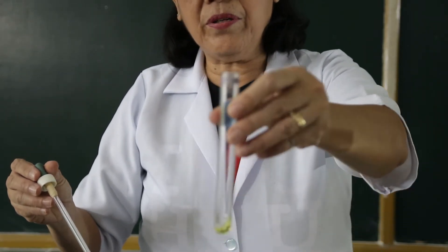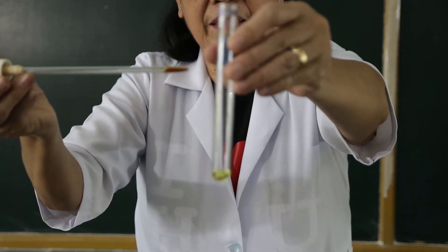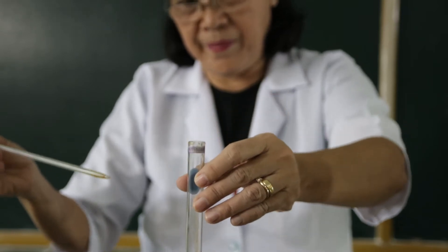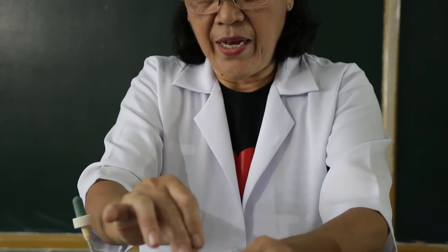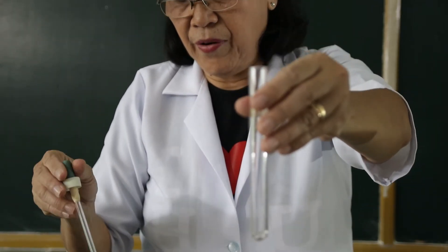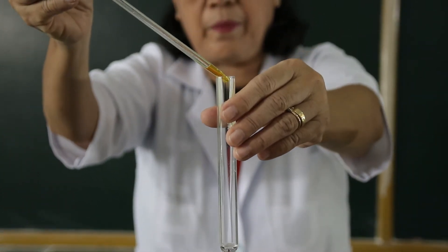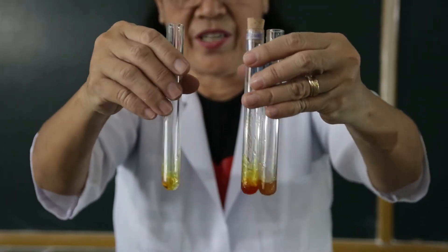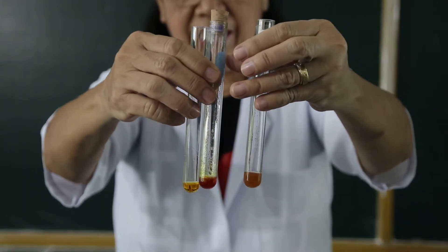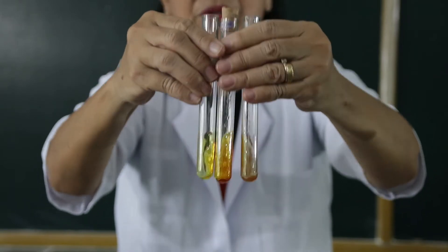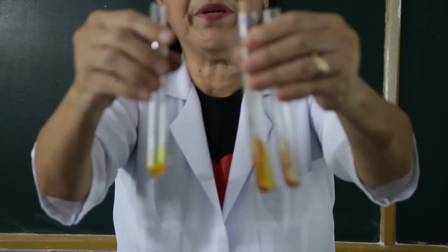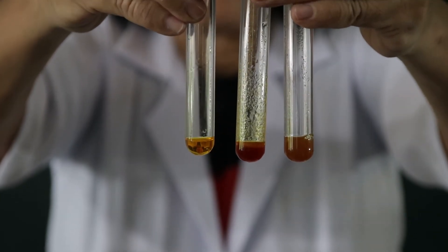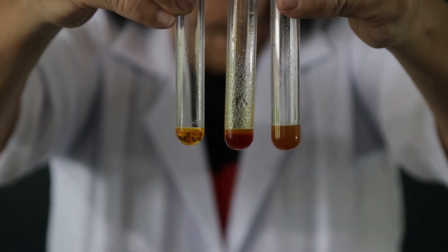We are going to drop also three drops of the 2,4-dinitrophenylhydrazine to the benzaldehyde. And to the acetone, we also add the 2,4-dinitrophenylhydrazine. Let us shake this mixture of the formaldehyde, the benzaldehyde, and the acetone. I want you to take note and observe what happens. Is there a formation of a precipitate? In which test tube is the precipitate formed?